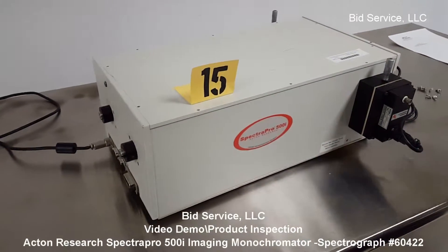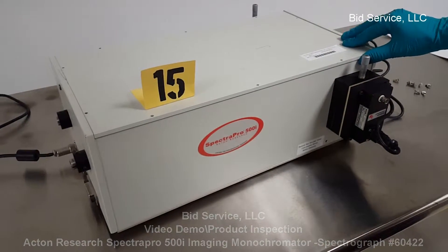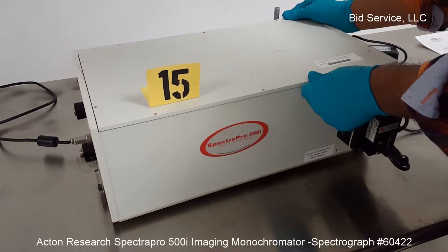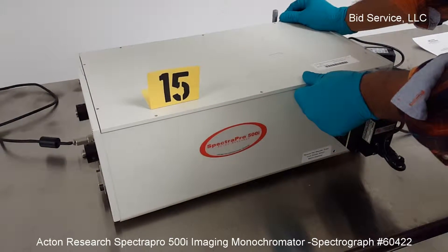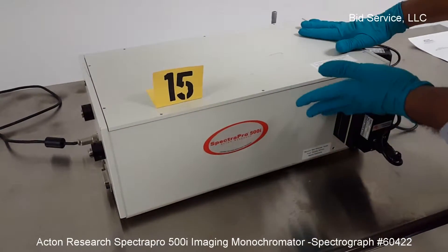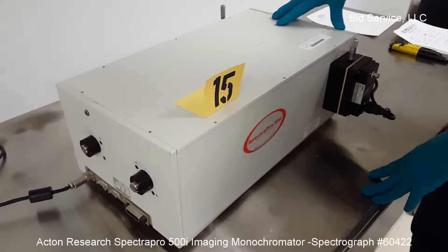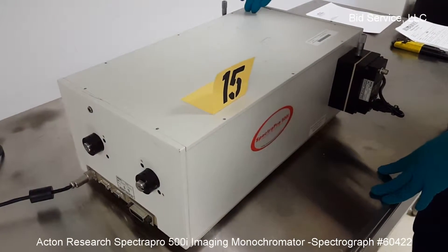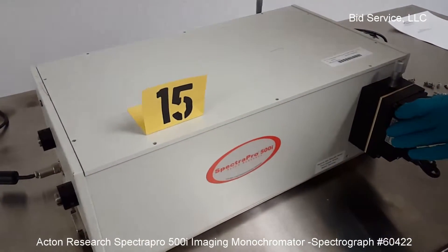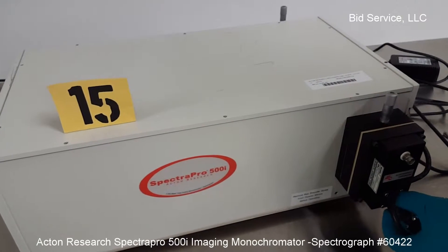SpectraPro 500i Acton Research Spectrograph System. This is a monochromator currently owned by Princeton Instruments. This instrument is pre-installed with a triple grating, and there's an inlet slit and an outlet. On the outlet there's an indium-gallium arsenide detector pre-amplifier.